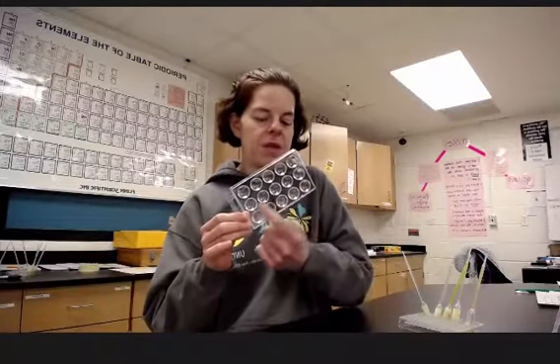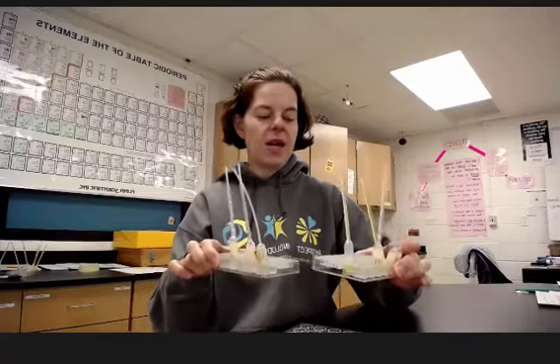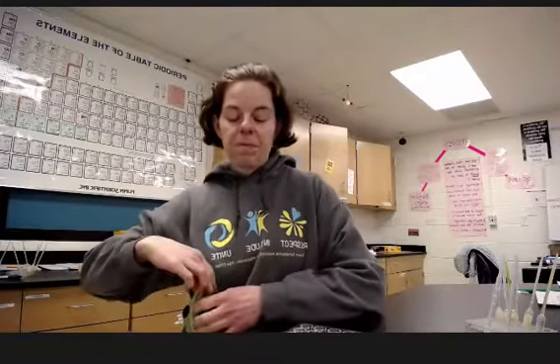Okay, so I just want to go through a little bit how you're going to do the lab. Okay, some things you're going to need. You're going to use a spot plate. Okay, make sure it's nice and clean when you start off. And then the chemicals that you have should already be laid out in droppers. Notice the droppers are all labeled, or there are a couple of sets of actual droppers. You're going to wear goggles for the lab.